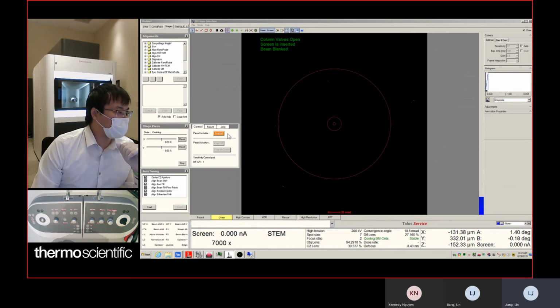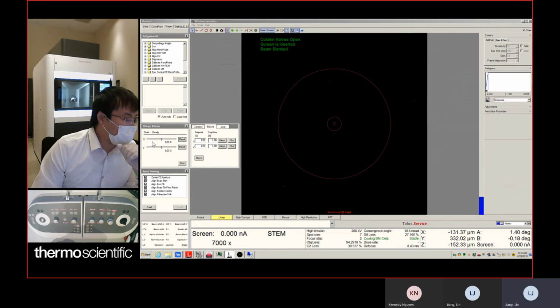Once enabled, you can move. You can move the step size to 1%. So the maximum range you can move is probably 2 micron. Once you reach the maximum value, you need to do a reset. So let me show an example here.